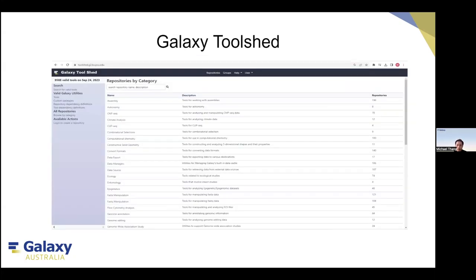Once tool developers develop a tool, it becomes available through the Galaxy Tool Shed, which allows other researchers or Galaxy team members to install tools from the Tool Shed. You can search for the tool you're looking for. Under the repository by category, for example, you can search for the BWA tool. If the tool is available on the Tool Shed, it will be listed underneath.